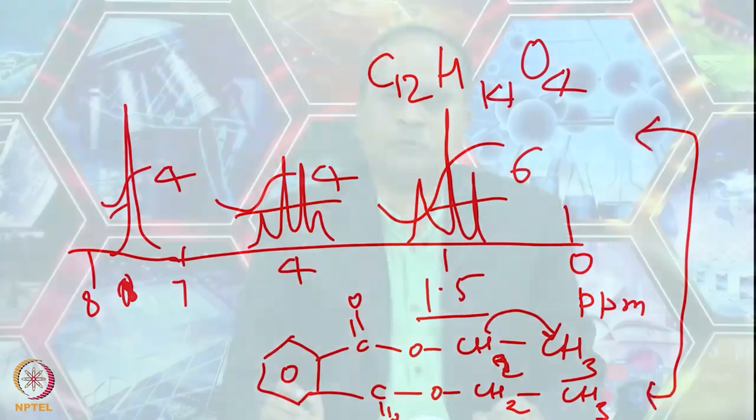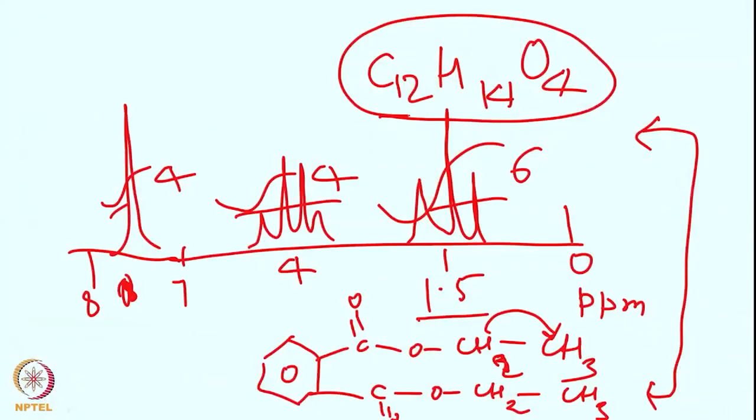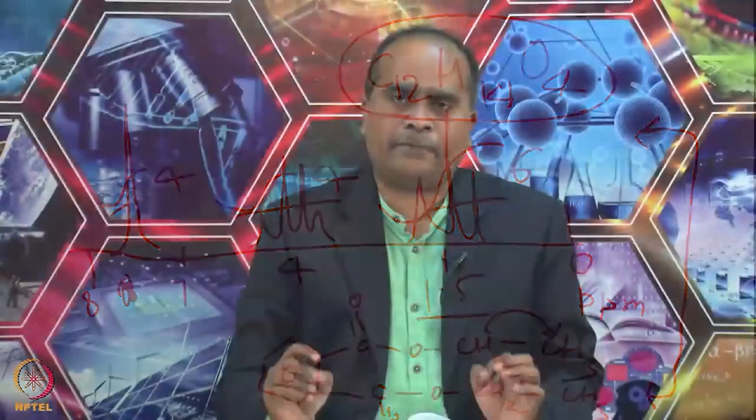So we will continue now. We have had good exposure to the chemical shift, how to interpret using chemical shift. We also introduced the coupling constant, and we looked at how the coupling constant gives the final structure. I mean, we learned, looking at the splitting pattern and the chemical shift value, how we can identify the chemical structure of a molecule. Now we are at a stage of going a little deeper and understanding the quantum mechanical formalism of the coupling constant, and then we looked at the interpretation of some of those. So I hope these things are clear to you, and the rest of the concepts will be cleared in the tutorial session.